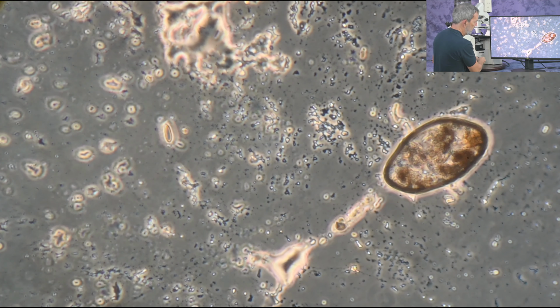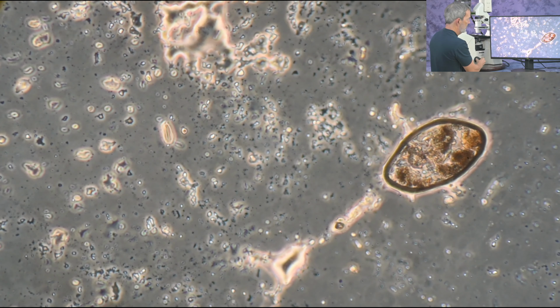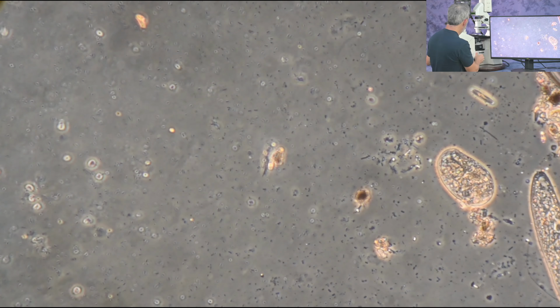So let's get in focus. Okay, that's phase only.